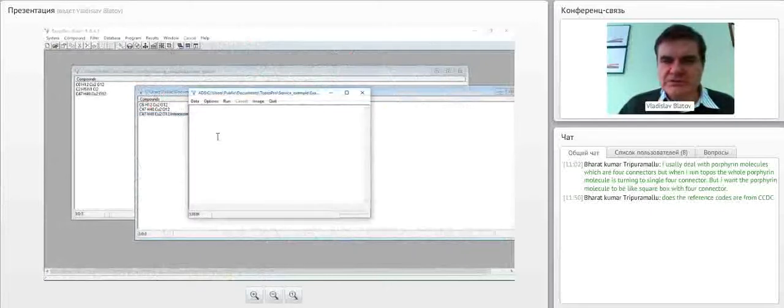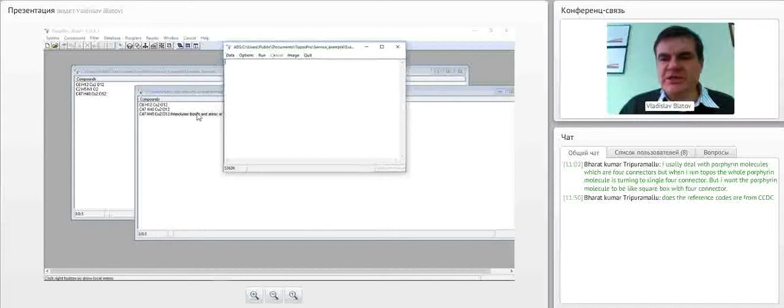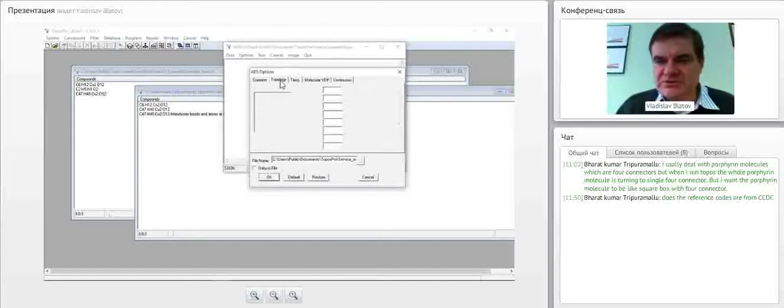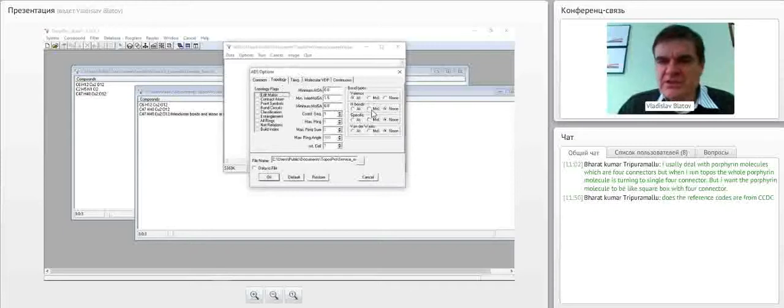Options. Now we switch again to standard method and change this parameter, this type of bonds. We have now valence bonds as interatomic bonds, intercluster bonds, let's say, and hydrogen bonds as valence bonds as intracluster, internal bonds. H bonds as intercluster, between the clusters, or intermolecular, it is called in Topos. So we need to specify them in this way.